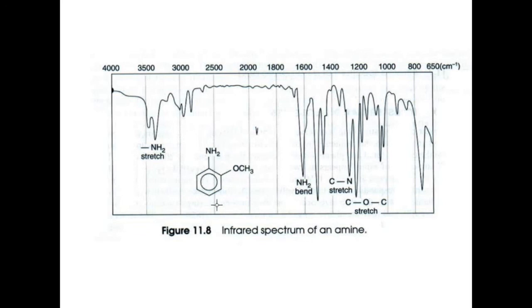All right. Now the aromatic ring, let's take a look at it. The CH stretches of the aromatic ring, we should see something above 3,000, and well, there it is. The peak is kind of squished a little bit, but that peak right there extends over 3,000, and indeed that's going to be caused by the aromatic CH stretches. Now we should see a band at 1500 and 1600 for the aromatic ring. Now that's probably the shoulder of this bigger peak. This NH2 is actually identified as a band, but you can notice it has a little shoulder here right at 1600, and that undoubtedly is due to the C-C stretch of the benzene ring. We should see something at 1500, and there we have it right here, 1500. That's the other peak that we see for the C-C stretch of an aromatic ring. And here we have the 1450 peak.